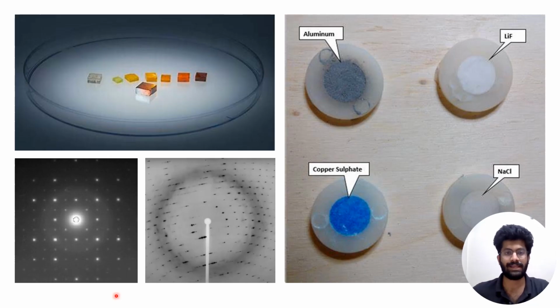Single crystal X-ray diffraction differs from powder diffraction in sample preparation and equipment required. Powder samples tend to give rise to continuous diffraction rings like these. In single crystal XRD, discrete diffraction peaks are observed like these. Using a single crystal X-ray diffractometer, peak positions can be transformed into a series of coordinates to recover the underlying crystal lattice dimensions or lattice orientation of the sample of interest.